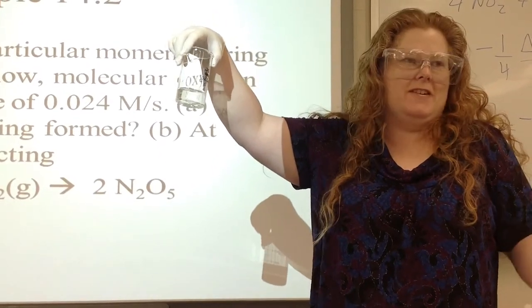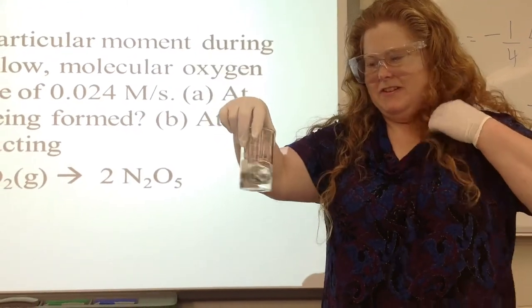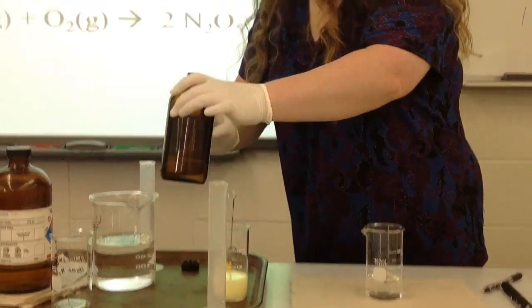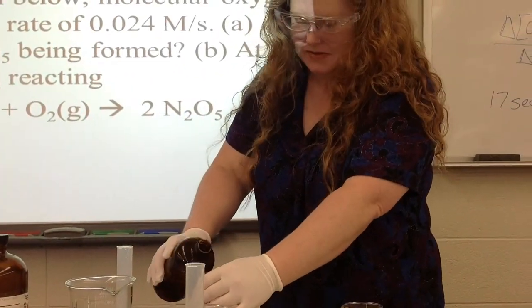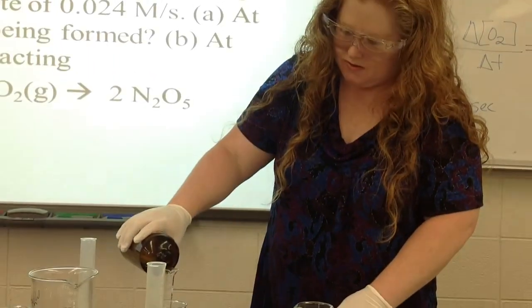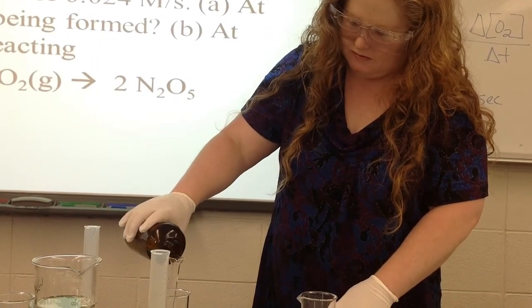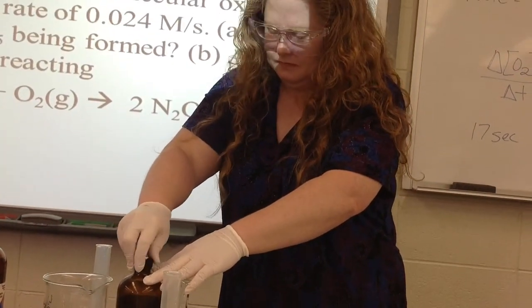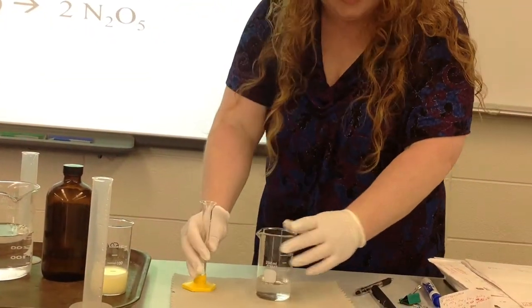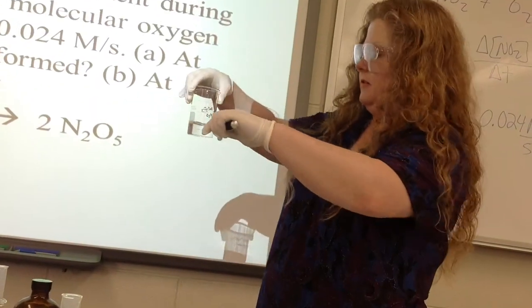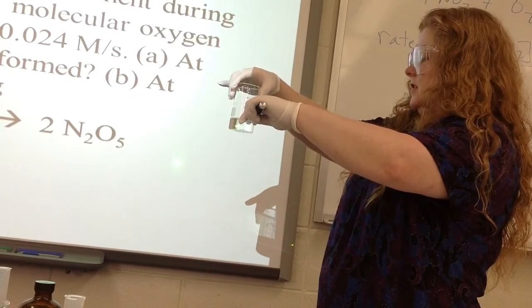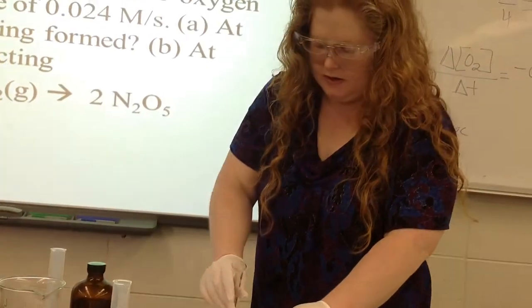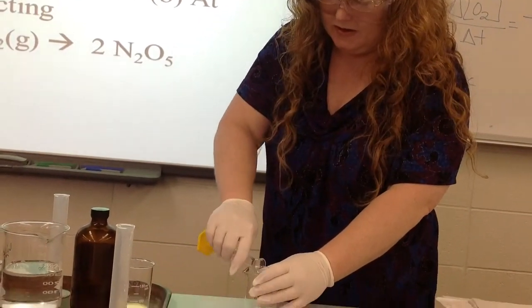Well, it's half of 0.02, 0.01, right? Okay. All right. So, it's 0.01 molar. All right. And, all right. So, you got the timer reset and we'll see what happens. So, I'm going to add another 5 milliliters of HCl. All right. So, again, of course, looking to start, we've got the light passes through very easily. And all right. Are you ready? All right. Let's go.